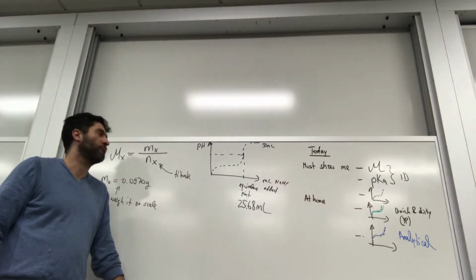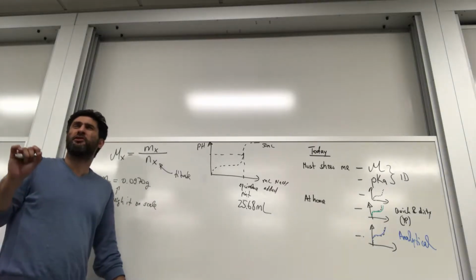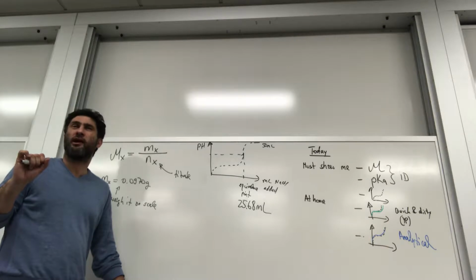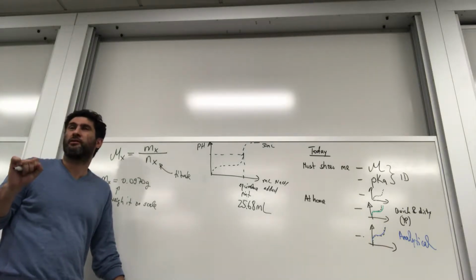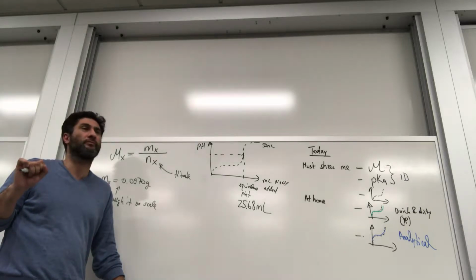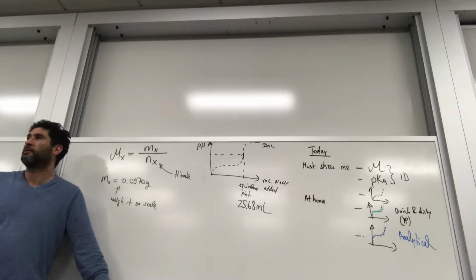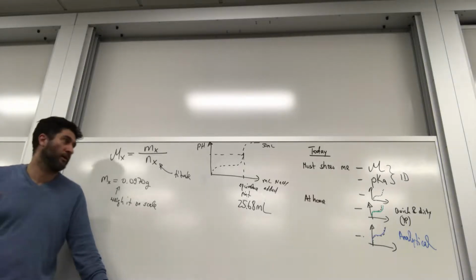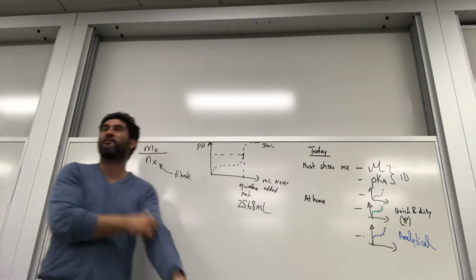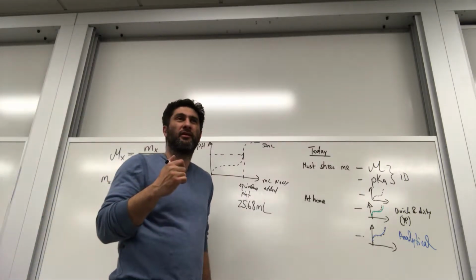All right. Now, there was a note in your procedure how to get the equivalence point. Does anyone remember? There's a graphical way in Excel, or other plotting software, to get to know the exact volume of the equivalence point. You guys remember? No.